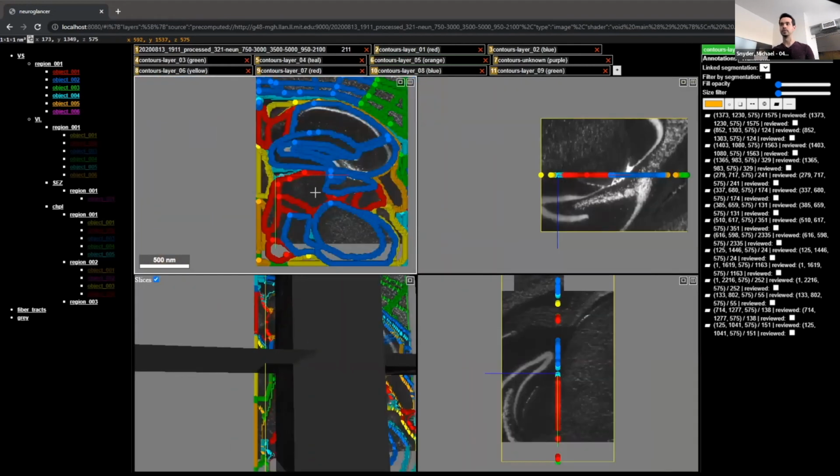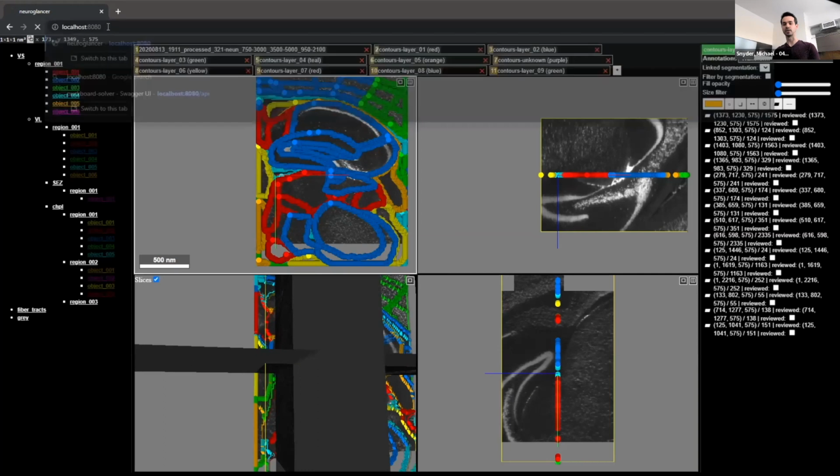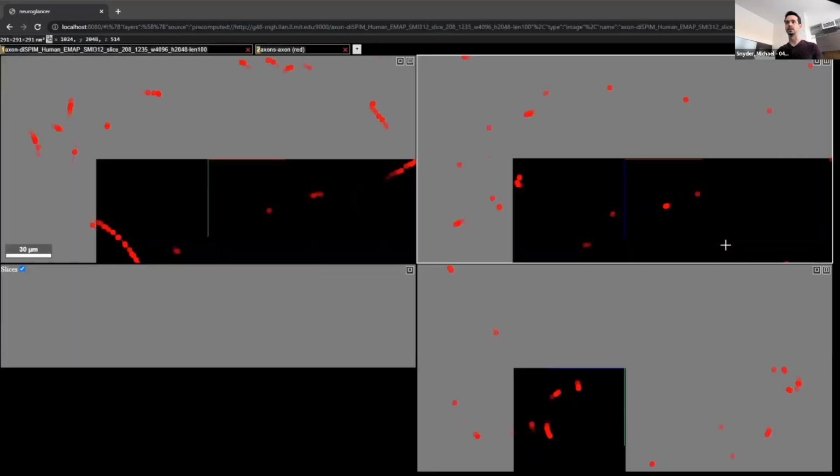And so that's a brief overview of looking at this workflow. The next data set portion of this demo will load in some axon data, which is looking at primarily line strings. And we'll see how we can filter those and navigate through and follow along amidst the sea of data there.